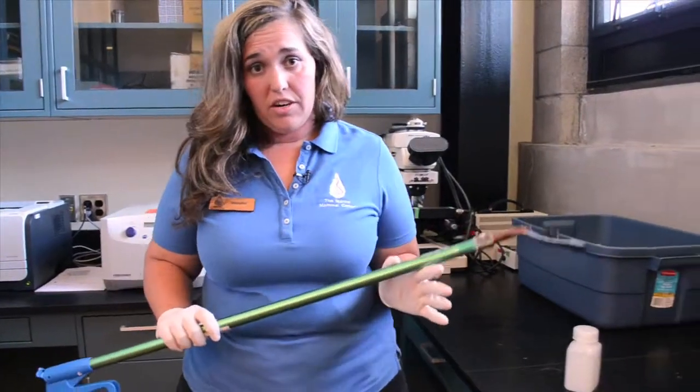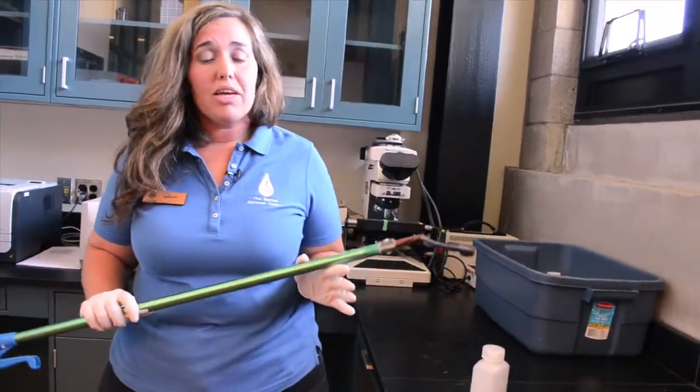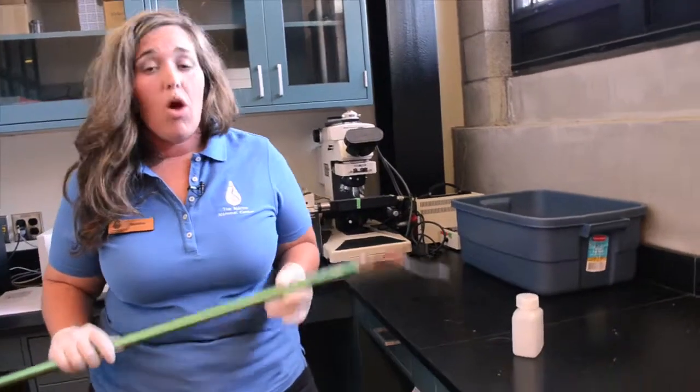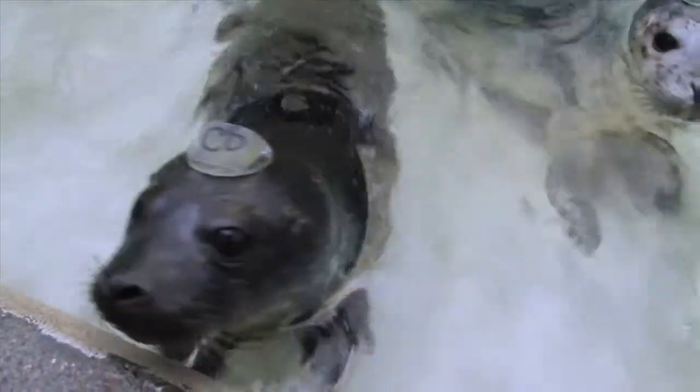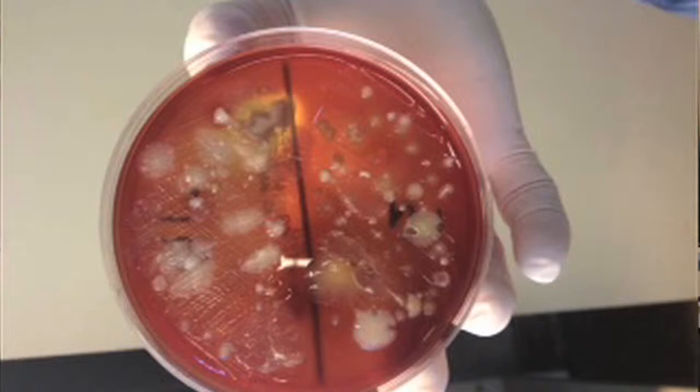Our veterinarians order these tests and we analyze them right here in the lab. Our patients live in the pools here, so it's incredibly important that we create a healthy artificial environment for them. One way we do that is by testing water quality and looking at what's growing in the water that our patients are living in. Each week we bring these water samples back to the lab where we analyze it, specifically looking at what type of bacteria is growing in our pools. We would take this water sample and actually create a culture where we would see what would grow within 24 to 48 hours, and look at whether or not that amount of bacteria was healthy or not for our patients.